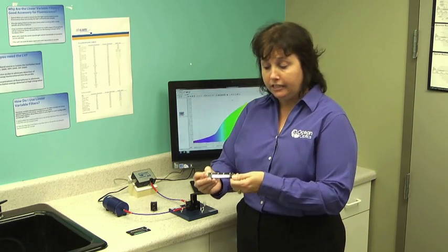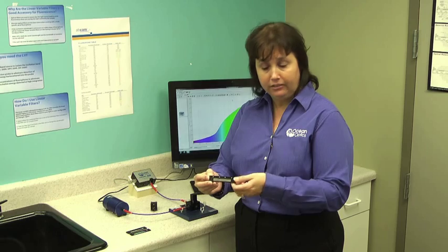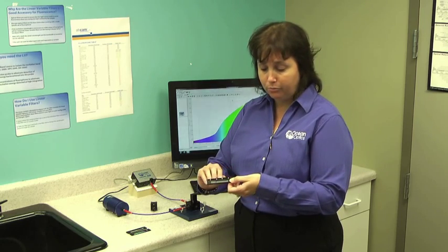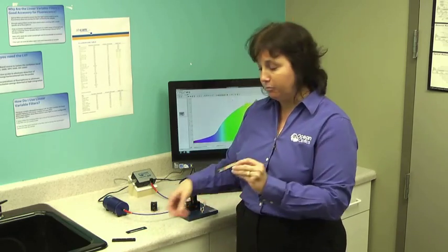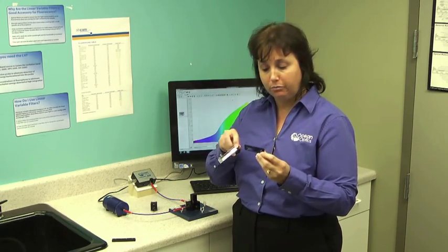I'm holding the linear variable band pass filter in my hand, but we can take these apart by removing these screws, and we find that we then have a linear variable high pass and a linear variable low pass filter.